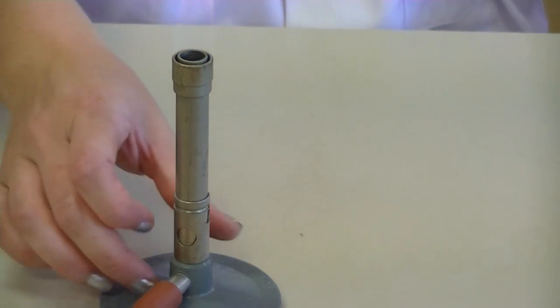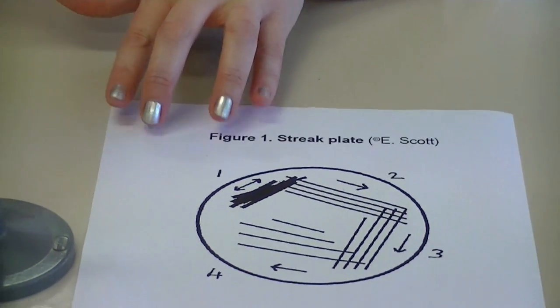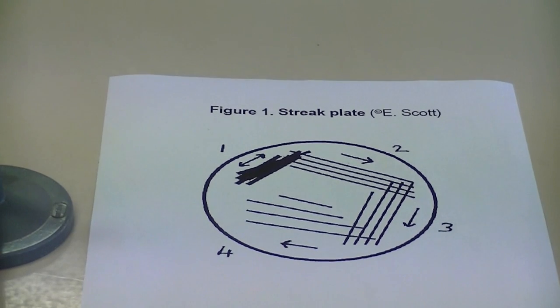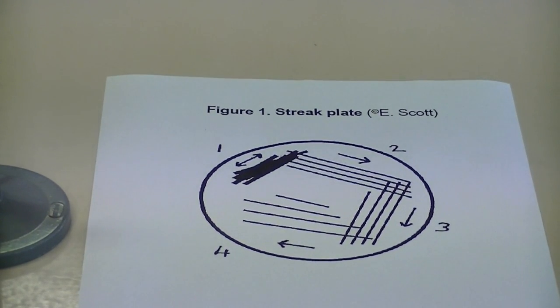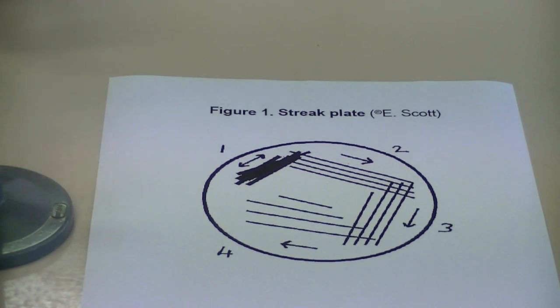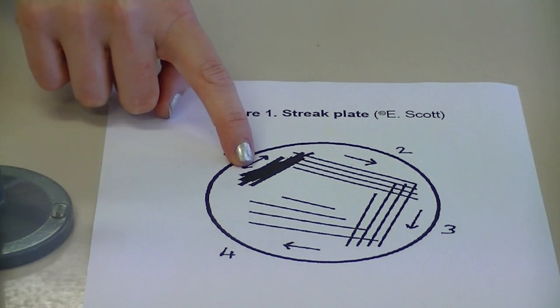The streak plate technique is actually shown in a diagram in your manual — this is figure one. To perform the streak plate technique, it requires you to use a sterile loop and to transfer some bacteria or yeast onto a plate and then to continue streaking it.